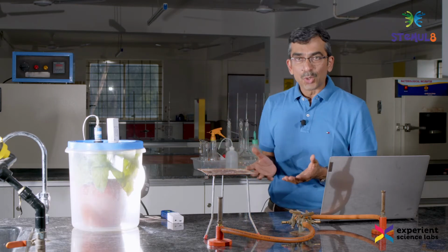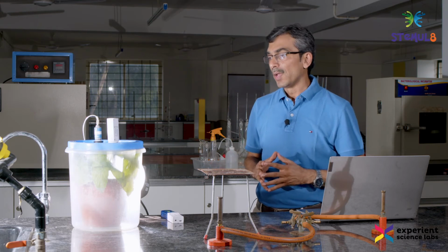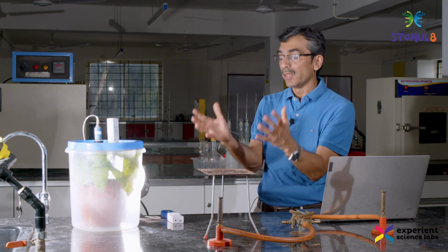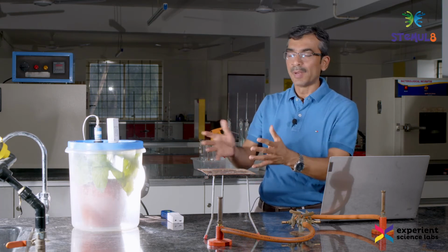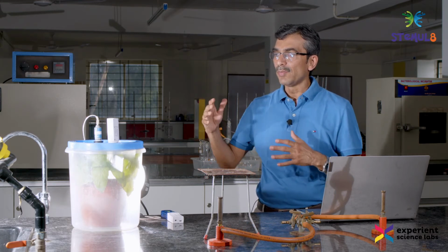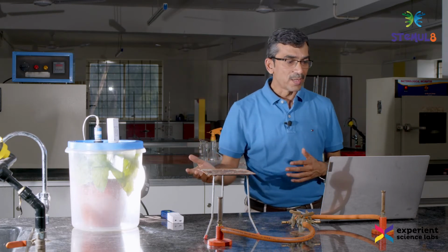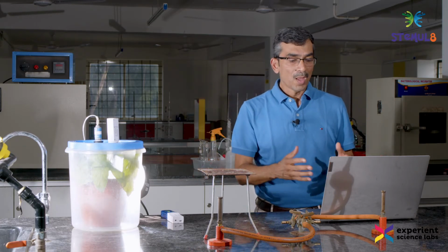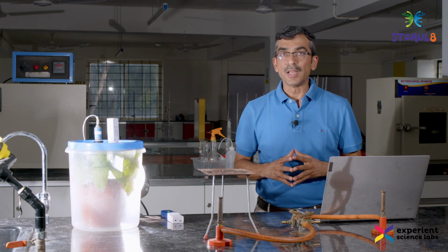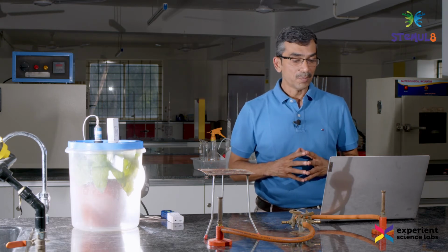In order to control the whole thing, as you can make out, we have put that whole thing in the jar. It's like a small chamber to control all the parameters, and we have connected these sensors, which are collecting the data, to the software, and it is plotting the data about carbon dioxide and oxygen.